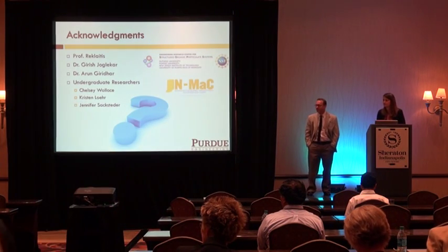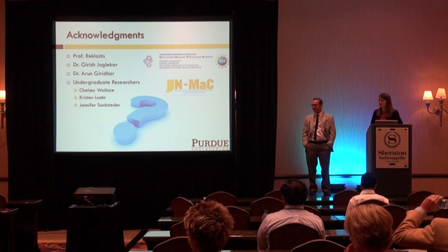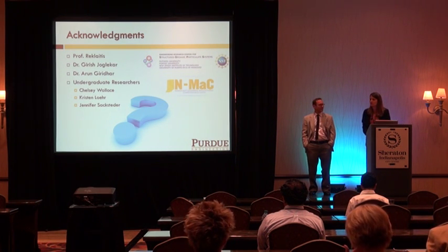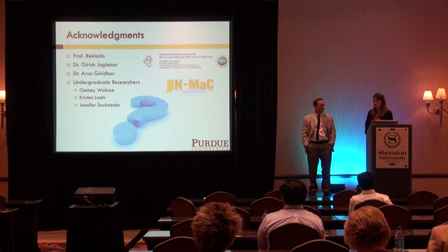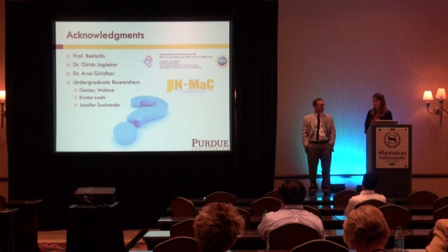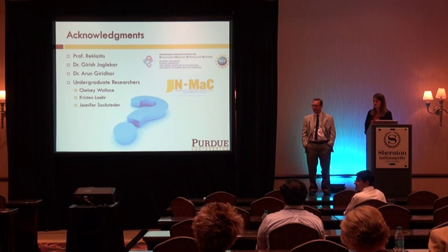Yeah, sure. So if you need to add a new workflow, who would program it and how long would it take to add? With the workflow editor, you can build your own workflow. This was one application on the drop-on-demand system, but we also have a continuous tablet manufacturing and also continuous crystallization processes. They are all PhD chemical engineering students, and they are developing the workflow themselves. Because you mentioned those types, if you need a new type, I was wondering what kind of involvement needs to go in there.